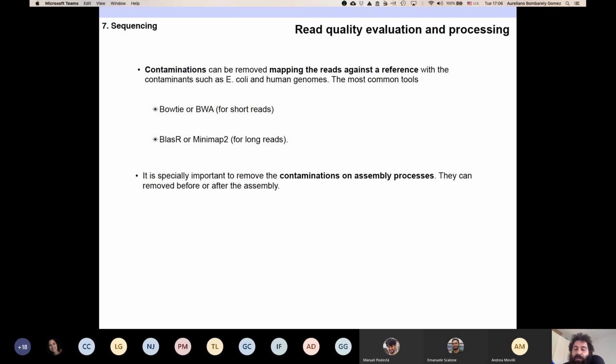So contamination is something that you don't need to clean. It's the thing that doesn't map. When you have a good reference, you don't need to be worried about contamination because you are going to map against it. Supposedly your contamination is not a plant, because if in your plant sample you have Arabidopsis and Brassica, that will be a problem. But also keeping in mind that you may not have the same mapping rate, still you can forget about that. But contamination is important.